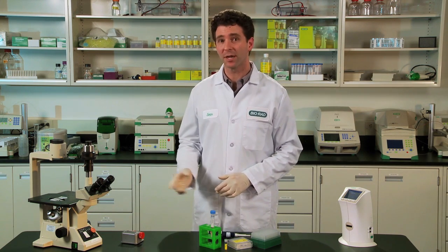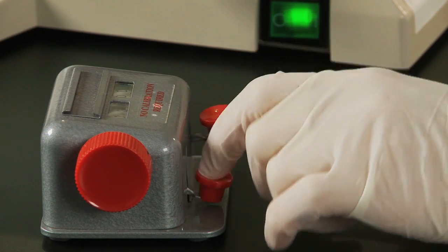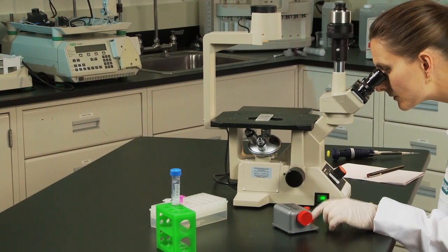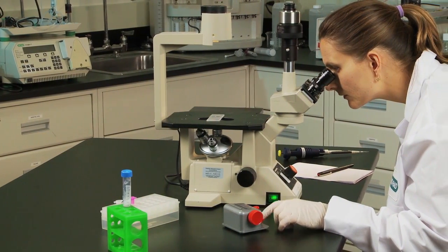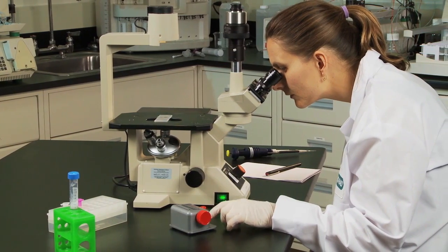If you work with mammalian cells, you know how tedious it is to count cells with a hemocytometer before splitting them or before running an experiment. The process is time-consuming, sometimes taking several minutes per sample, and you often have to recount samples to have confidence in the result. If you count multiple cell lines a few times per week, your time at the microscope rapidly adds up.